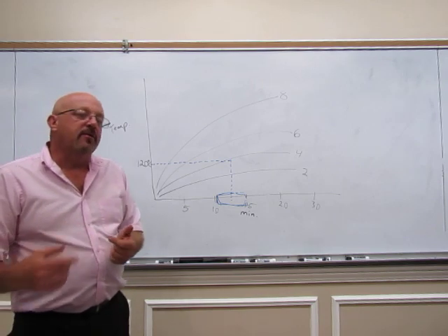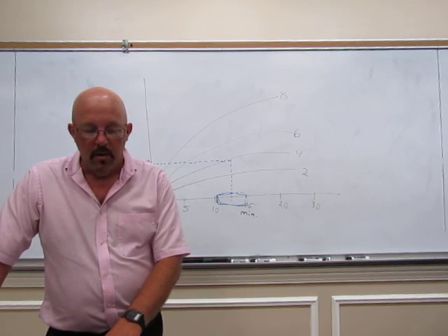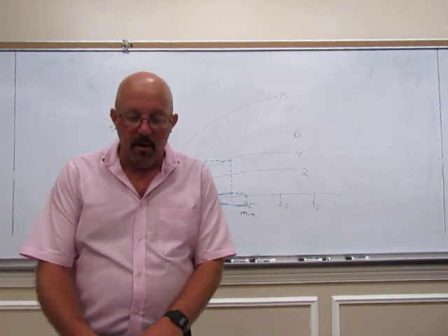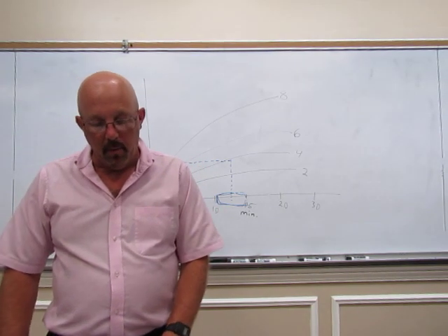So you can use that to confirm the identity of a compound. Just mix them and retake the melting point. If they're the same, you will get the same melting point. If they're different, you're going to get a lower and broader melting point.